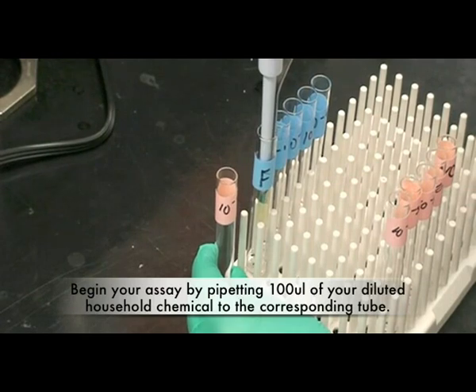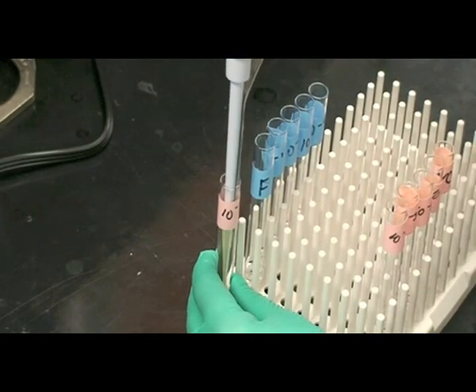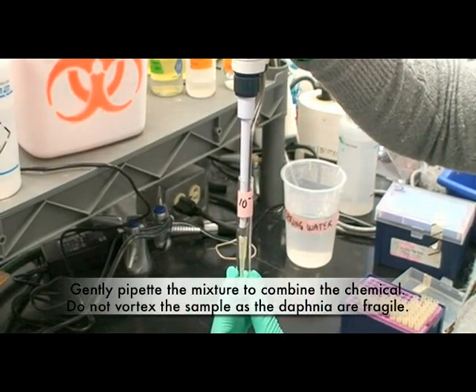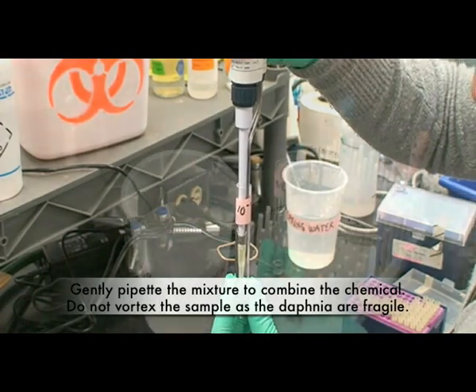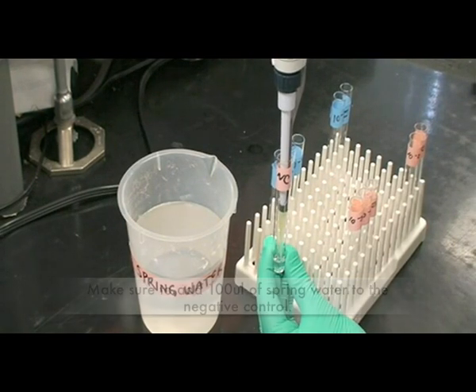Begin your assay by pipetting 100 microliters of your diluted household chemical into the corresponding tube. Gently pipette the mixture to combine the chemical. Do not vortex the sample as the Daphnia are fragile. Make sure to add 100 microliters of spring water to the negative control.